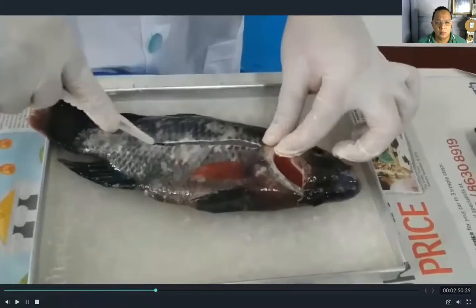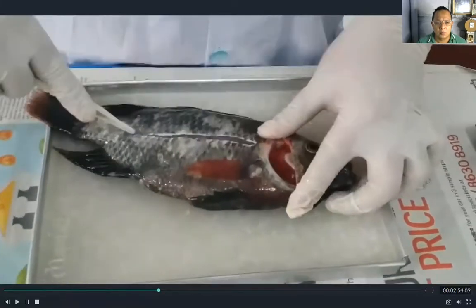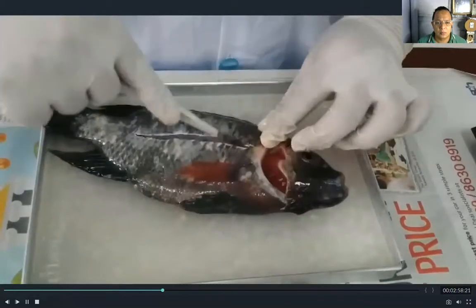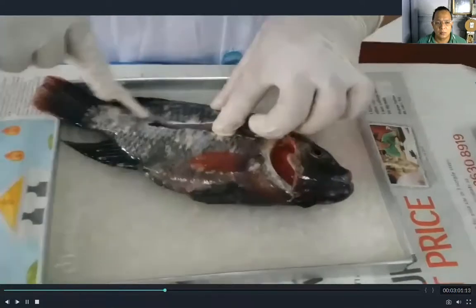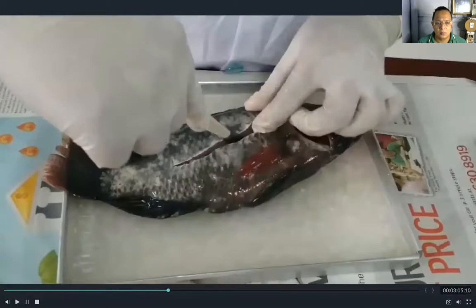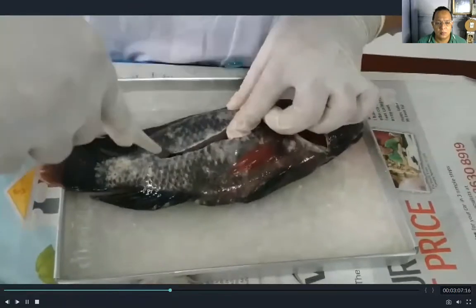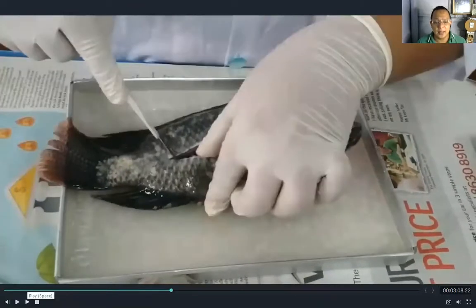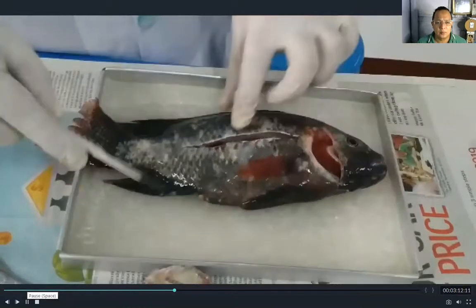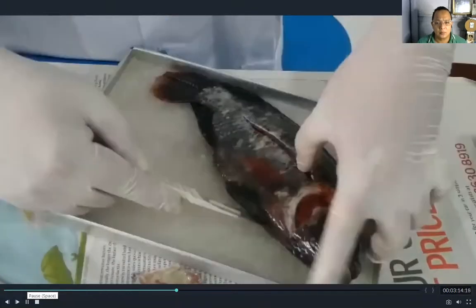You need to be very, very careful not to cut the internal parts of the fish when opening it. Let us open this part carefully.